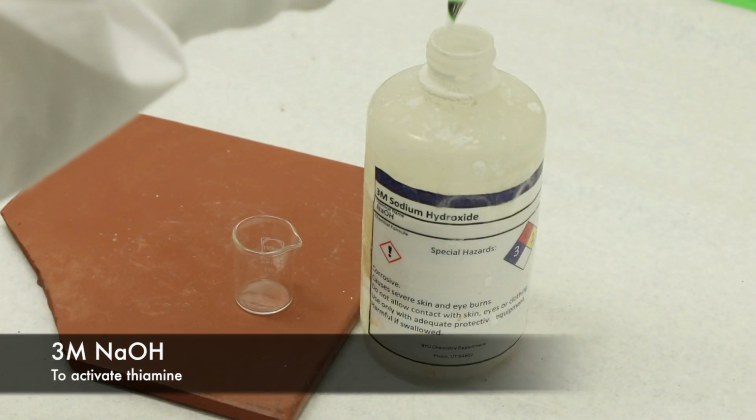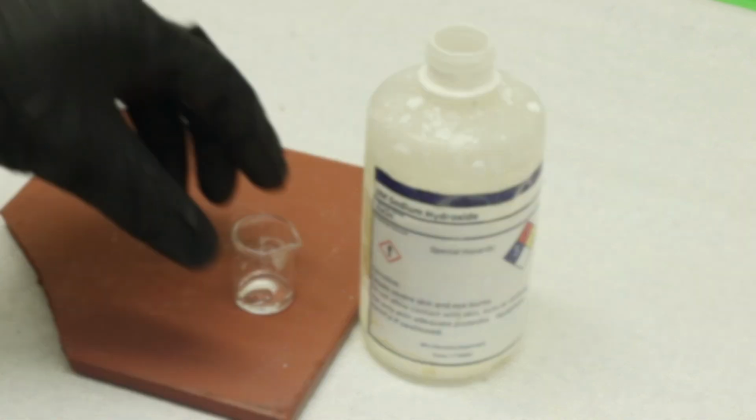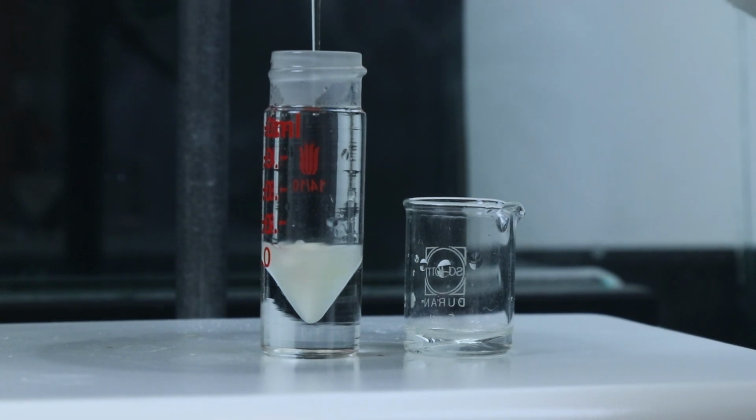Then I'll get some 3 molar sodium hydroxide, which will be used to activate the thiamine, and I'll be adding that dropwise just until the solution turns and remains a bright yellow color.